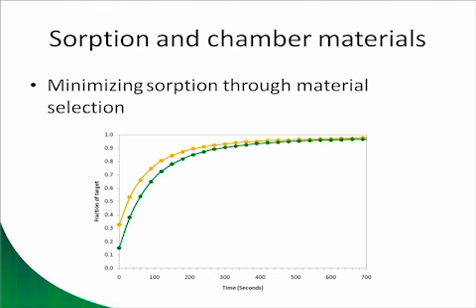In terms of materials to use, acrylics are a staple for custom chambers. They're readily available and easy to work with. However, they absorb a lot of water. In general, cell cast products are better than extruded products, but for either, sorption's relatively high, and you wind up needing to reduce this somehow. And one of the things that we recommend is the use of Teflon film.